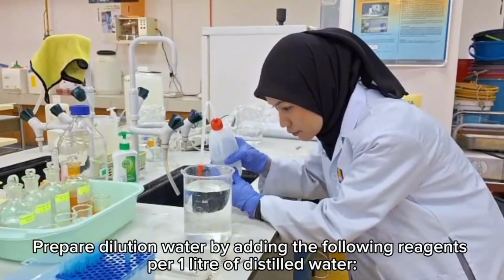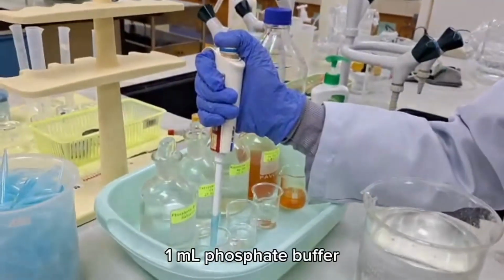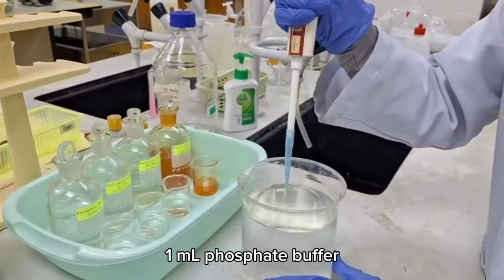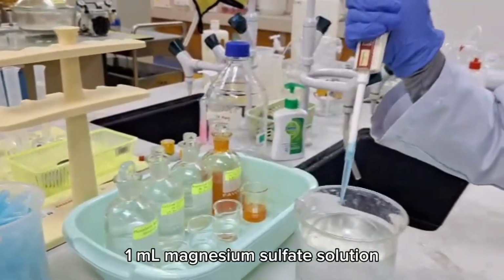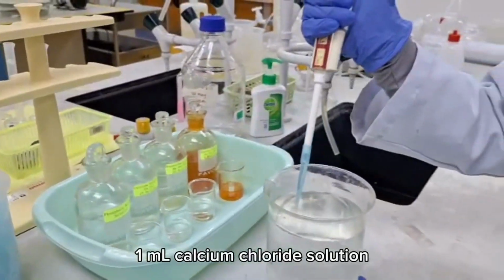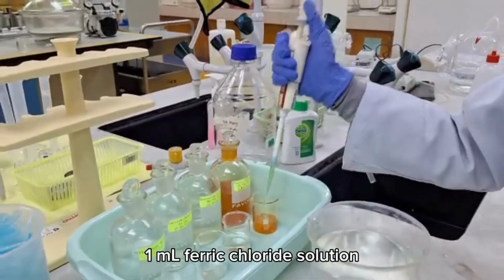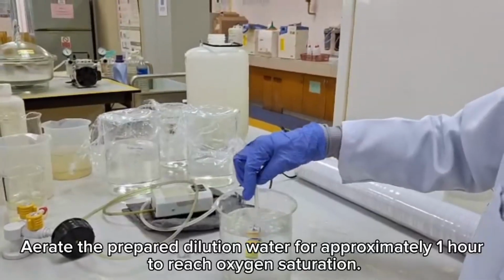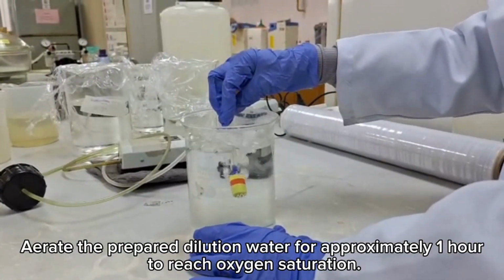Prepare dilution water by adding the following reagents per 1 liter of distilled water: 1 milliliter phosphate buffer, 1 milliliter magnesium sulfate solution, 1 milliliter calcium chloride solution, and 1 milliliter ferric chloride solution. Aerate the prepared dilution water for approximately 1 hour to reach oxygen saturation.